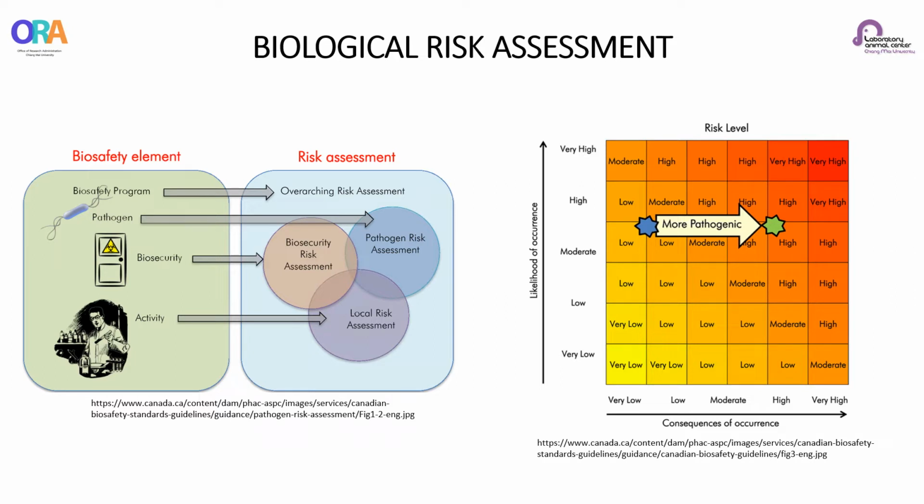The biological risk assessment is the main point of this session, and it is key for working safely in biological containment. Whatever research you will be working in, you must assess the risk you face properly. The biological risk assessment process is used to identify the hazard characteristics of an infectious or potentially infectious agent or material.